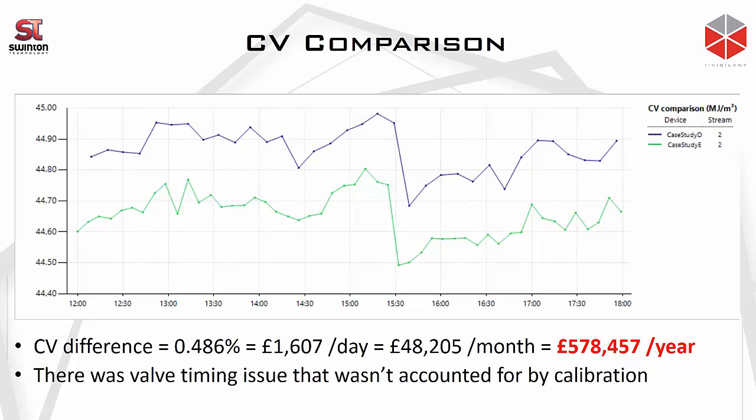What happened here is that we have an isomer, in this particular case cyclohexane, that does not exist in the actual calibration gas. So on GC A, some of the cyclohexane got transferred across to the heptane. On the other GC, all cyclohexane is measured as cyclohexane.